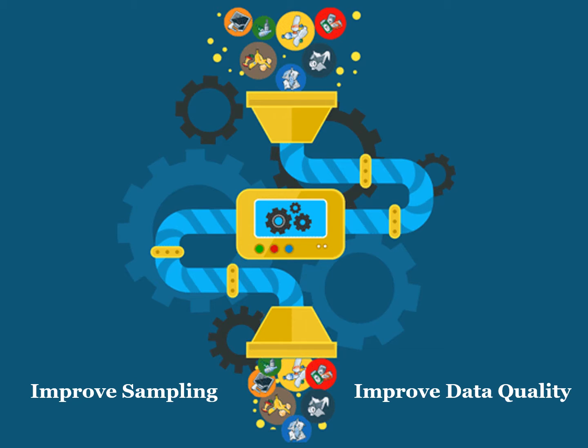At AEMTEK, we strive to provide accurate, fast, and reliable analytical services to our clients. Results of laboratory testing are limited to the exact samples provided by the client. So proper sampling is a prerequisite for accurate laboratory testing and meaningful results. Therefore, by improving sampling procedures, we can improve data quality.